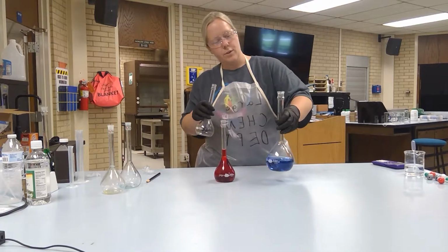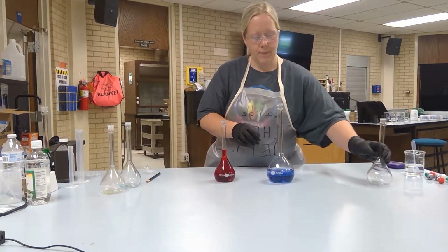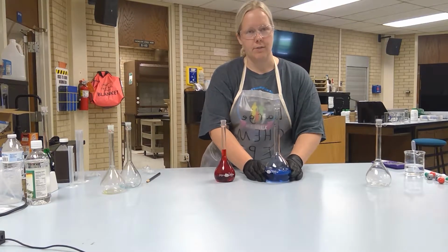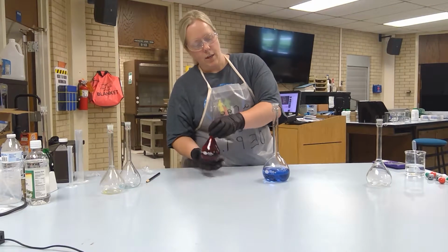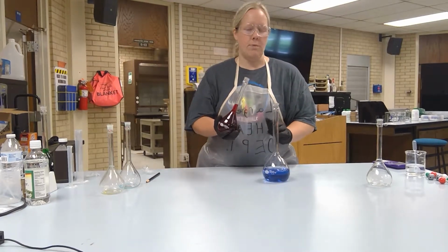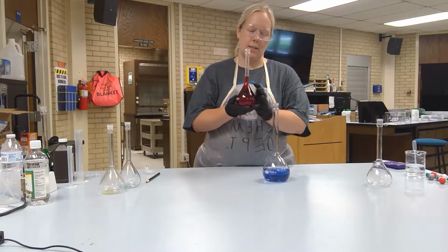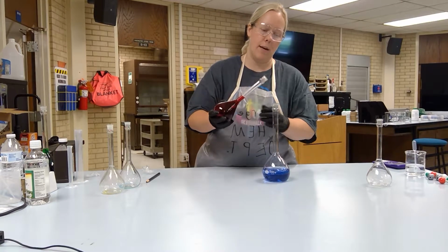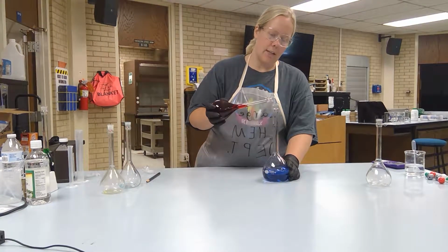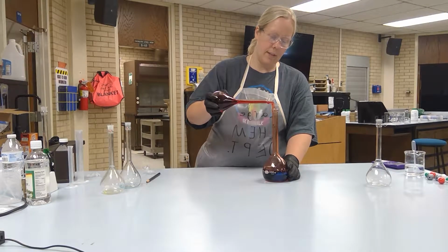So what I've done so far is just taken this 250 milliliter blue solution and transferred it to this 500 milliliter volumetric flask. So right now there should be 250 milliliters of solution there. I'm going to take the second 250 milliliter solution that just happens to be colored red, and I'm going to add it to this solution again and see if I do get 500 milliliters.